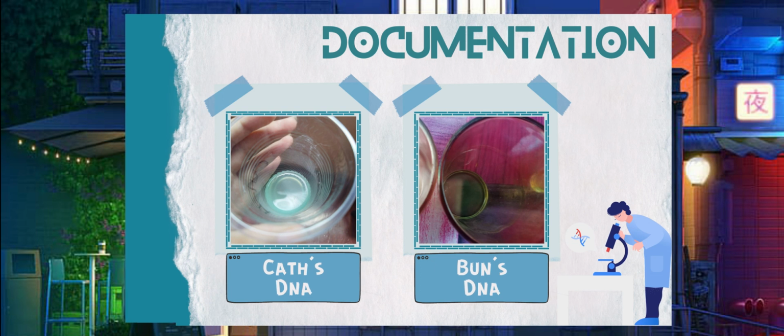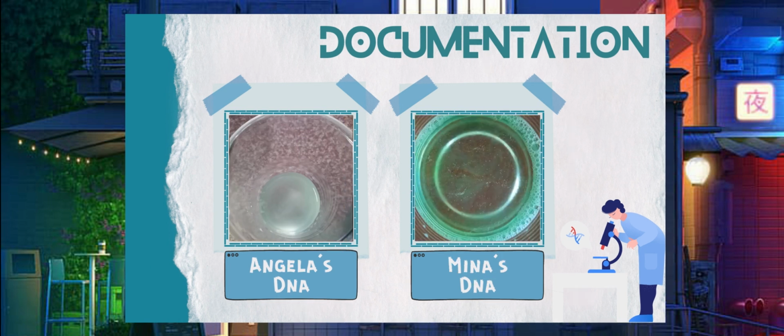The other experimenters, Angela and Jasmina, failed to succeed in extracting their DNA on the first try but managed to extract theirs after repeating the procedures meticulously. However, they extracted only a small amount.